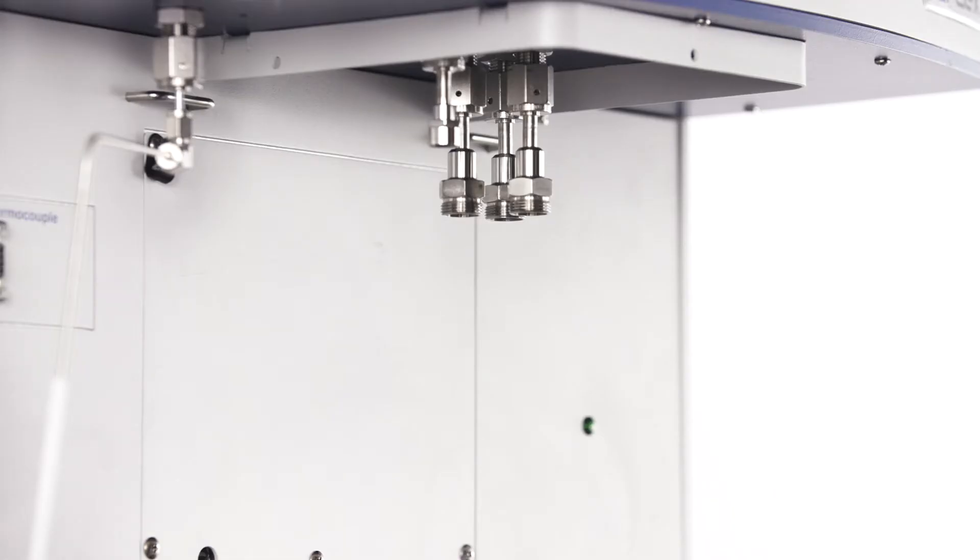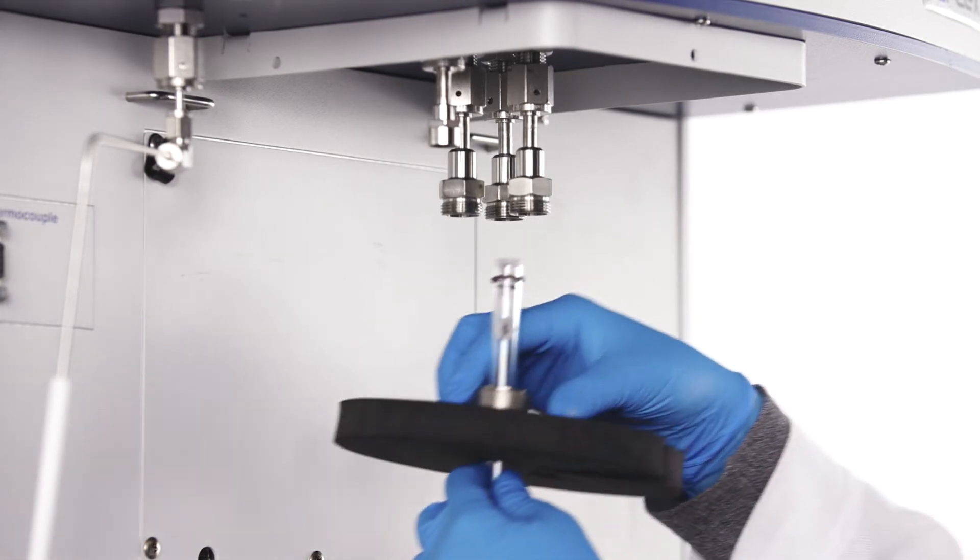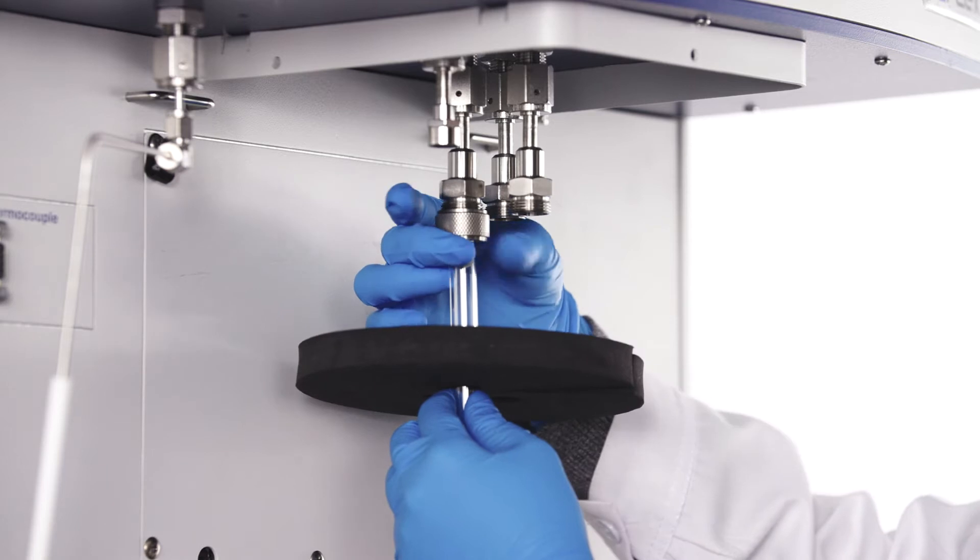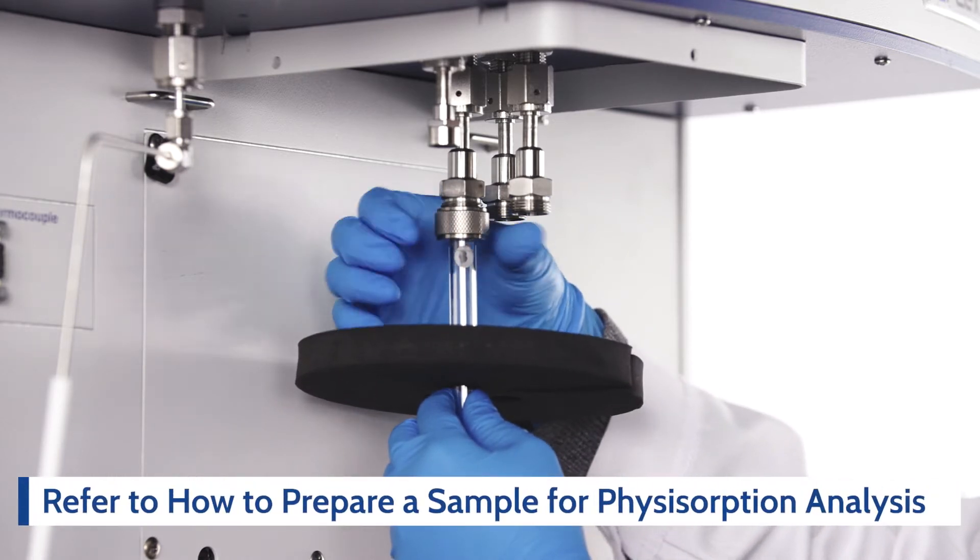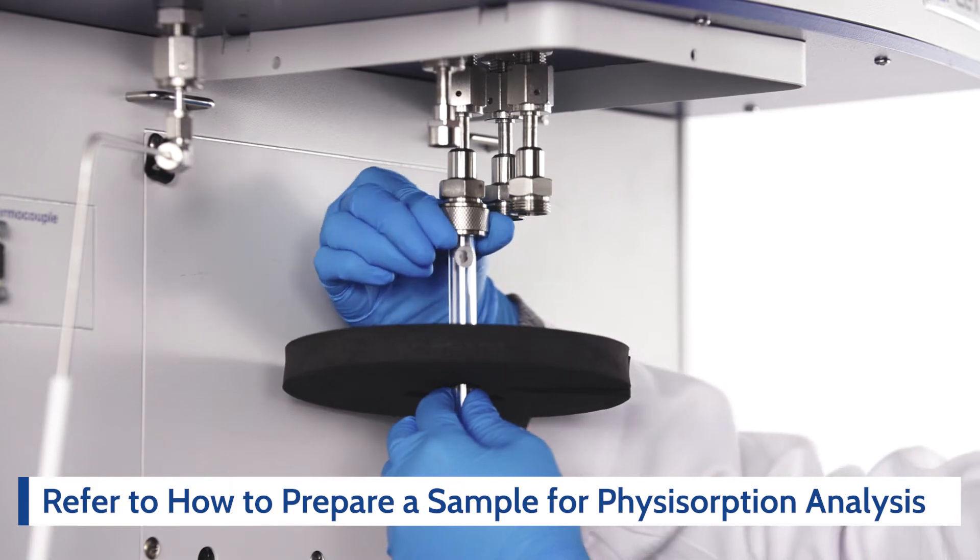Slide the isothermal jacket, doer cover, nut, ferrule and o-ring in order. Tighten the nut until it is finger tight. Please refer to the 3FLEX Physisorption Sample Preparation video for more information.